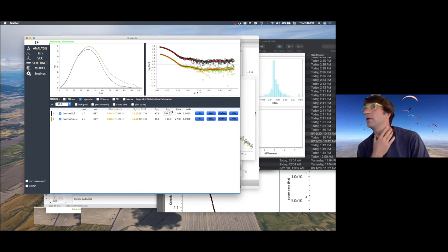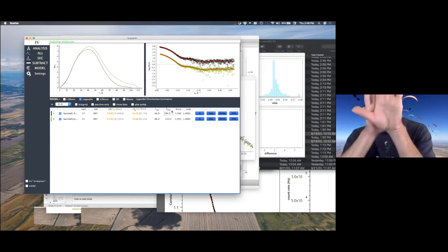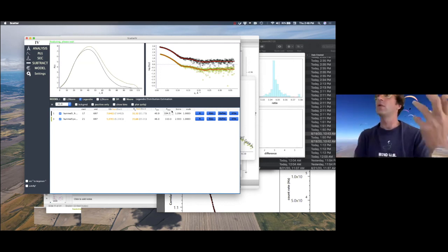Rob, I know you're not a really big fan of the EFA. I'm not using it for peaks that are really close to each other or that you cannot distinguish. But if you have a slight separation of the peaks, multiple peaks under the size exclusion, I have cases, especially this one, where I can confidently say this is, I would say, a transient behavior, but there are only particle A, a larger complex, and particle B. If you have something that is very dynamic, it's much more difficult, and I would never use it.